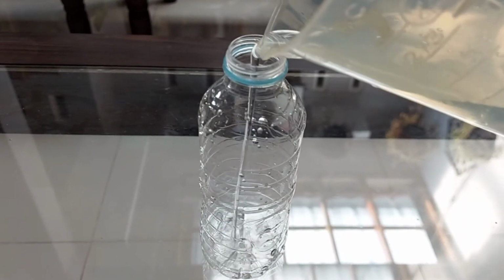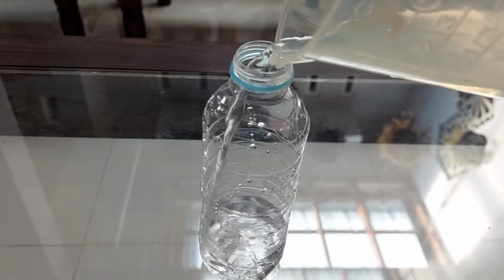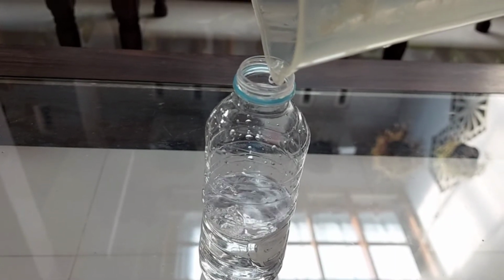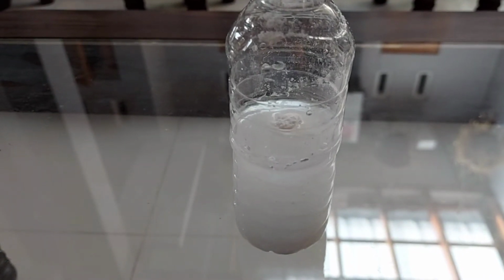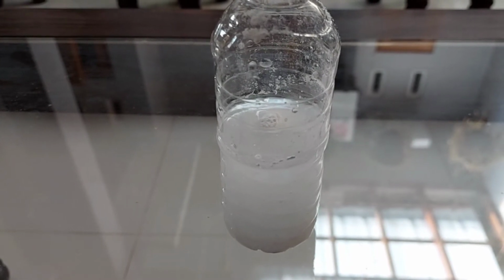In this experiment, we will make a simple suspension of flour and water with an amount of 10% weight per volume, which means 10 grams of flour dissolved in 100 ml of water. Then let the flour sink and dissolve on its own.